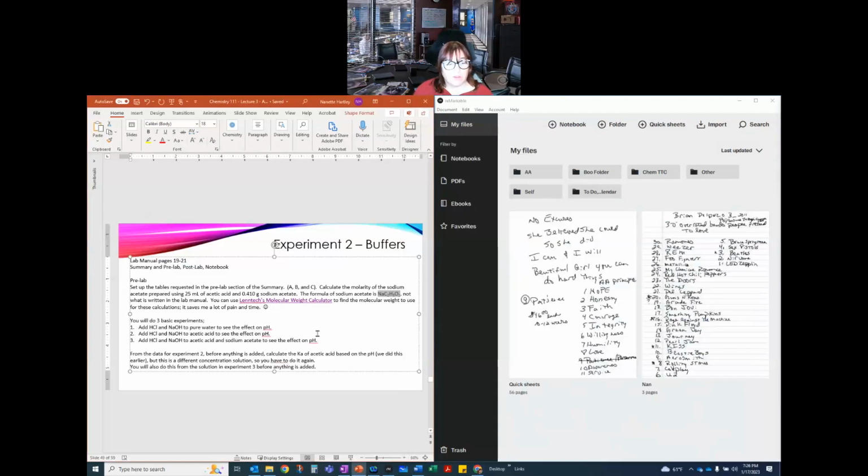All right, you'll do 3 basic experiments. First, you're going to add HCl and NaOH to pure water to see what happens to the pH. So you're going to measure the pH, add HCl, measure the pH, add NaOH, and see what happens. Then we're going to add HCl and NaOH to acetic acid to see what happens there. And then you're going to take the acetic acid, add some sodium acetate to it, and add HCl and NaOH to that to see what the effect is there.